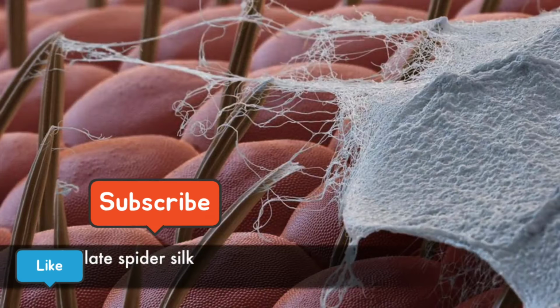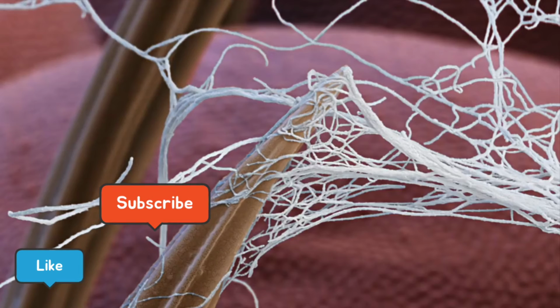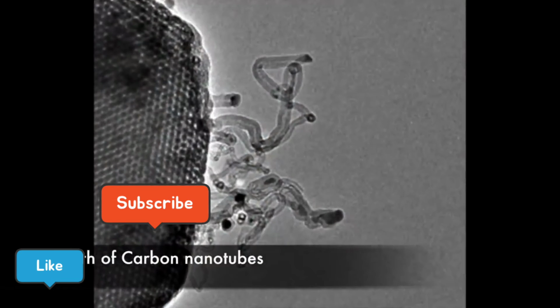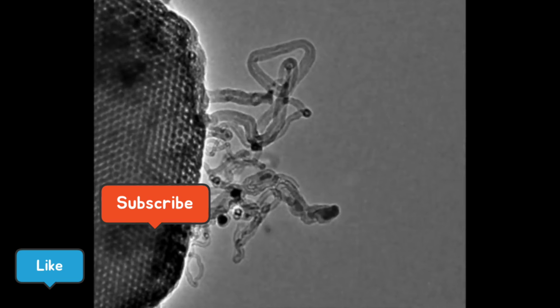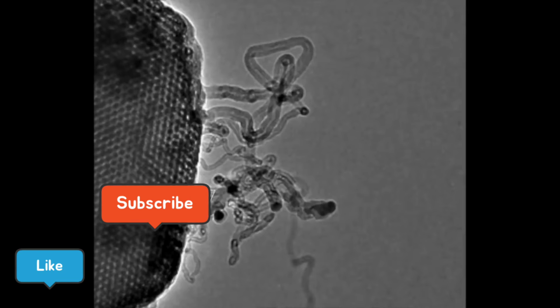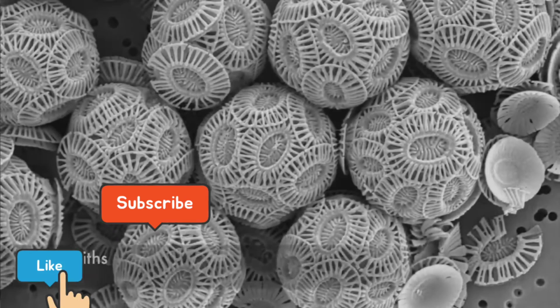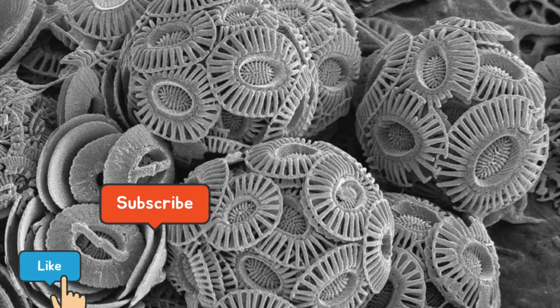Spider silk from a cribellate spider, whose silk does not contain glue for catching prey. The silk fibers are extremely thin and adhere by van der Waals forces. Here it is shown on the eye of a fruit fly. Growth of carbon nanotubes observed at high resolution in an electron microscope. Coccoliths, some of the tiny calcareous nanofossils that make up chalk.